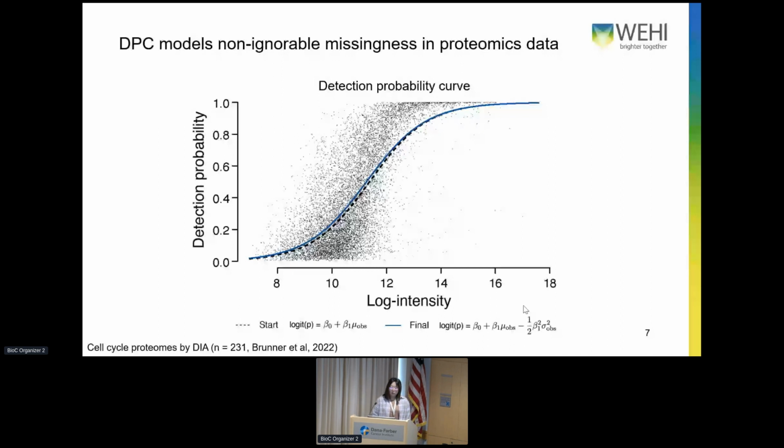Another option is to apply the DPC on the peptide level. In particular, if we consider the protein quantification problem, where we need to summarize the peptides into proteins to obtain the protein expression levels, we're using the DPC to represent the missing values and fit an additive linear model by maximizing the posterior with a diffuse prior. After getting the protein expression levels, we can then perform a customized limma analysis for differential expression.